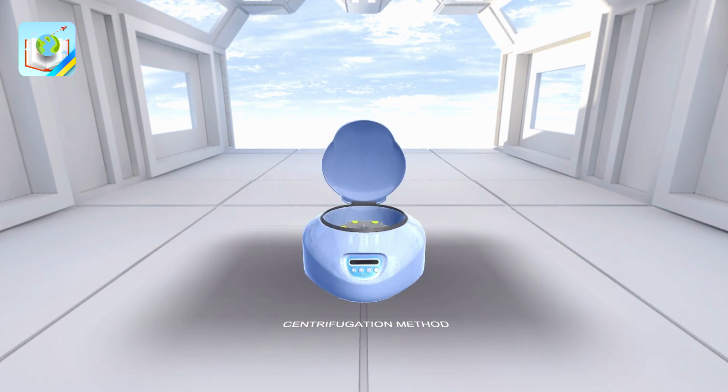Let's schematically depict and divide the constituent cells. Let the green ones be light, red ones heavy, and blue ones medium-sized. As a result of centrifugation, these particles will have a different sediment formation rate. Red particles, being the densest of all, will sink to the bottom faster than the others.